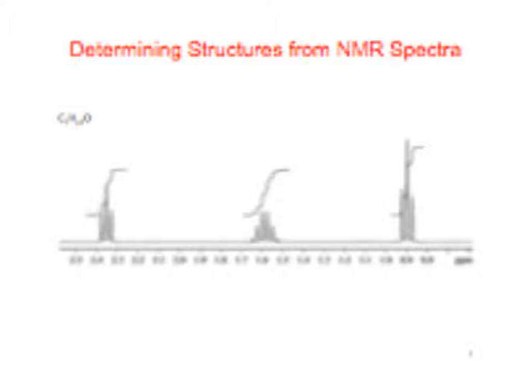So let's start out simple here. Take a moment, calculate your unsaturations, and see if you can come up with some structure for this proton NMR.